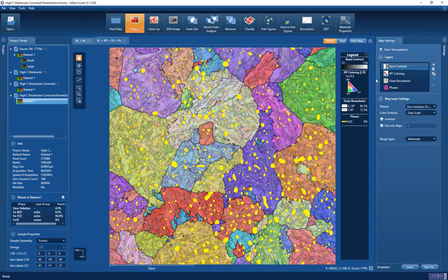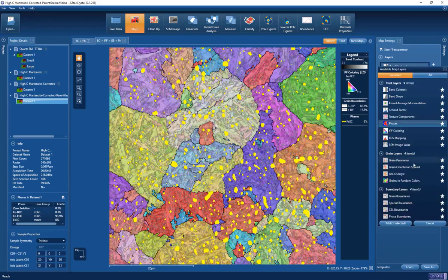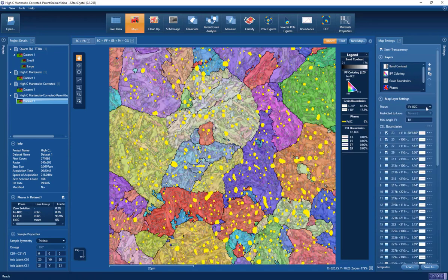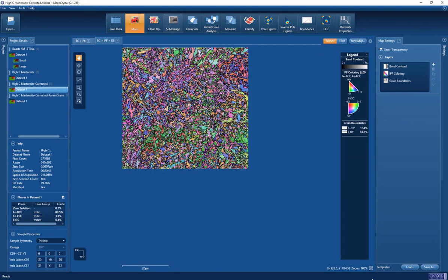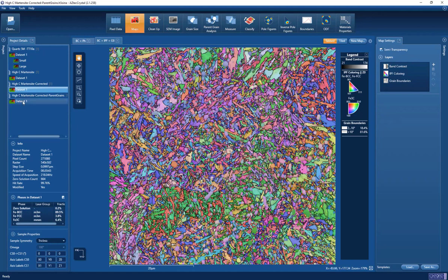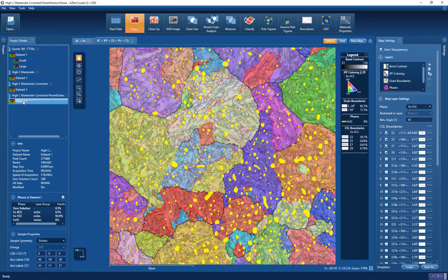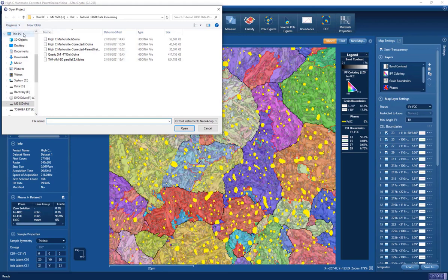We save the reconstructed microstructure into a separate data set and can examine it as if it were data collected live at the microscope, seeing those prior-austenitic grains very clearly. We can also start looking at boundaries — for example, adding coincident site lattice boundaries into the map for the FCC phase. We can see the presence of a lot of twin boundaries; in fact more than 50% of the high-angle boundaries in this data set are twin boundaries. This allows us to correlate between the original microstructure and the reconstructed parent microstructure to understand the high-temperature processing that led to it.